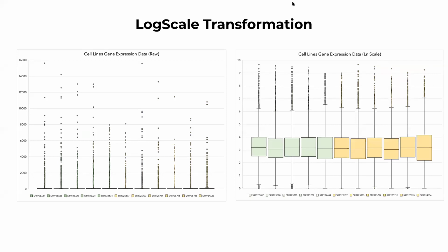But as he probably mentioned, we started with a table of expression in regular scale. That regular scale, as you can see right here on this side, really does not provide you with enough detail about the main properties of data. The properties of data that are important for a parametric statistical test are those it assumes: the mean and the variance.